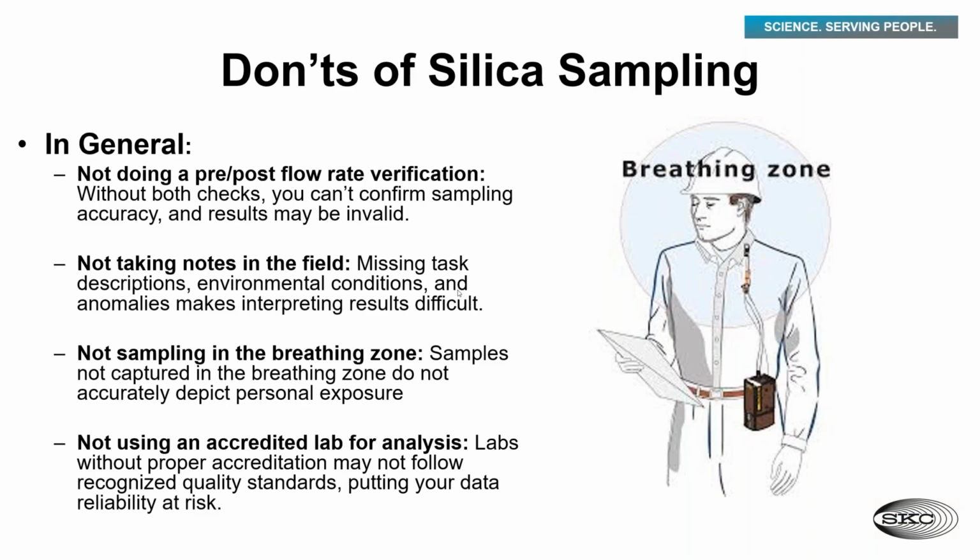Not taking notes in the field, like I said: do everything you can to take good, productive notes. If you can take pictures, if you can take videos. I never got back from a sampling event and said, man, I wish I would have taken fewer pictures, or, man, I wish I would have taken less notes. It's always the other way around. Man, I wish I would have taken just a couple more pictures. I wish I would have noted a little bit more about this. So while you're there, observing the process, checking in throughout the day, taking as many notes as you can is going to help you tell the story of that sample throughout the day.